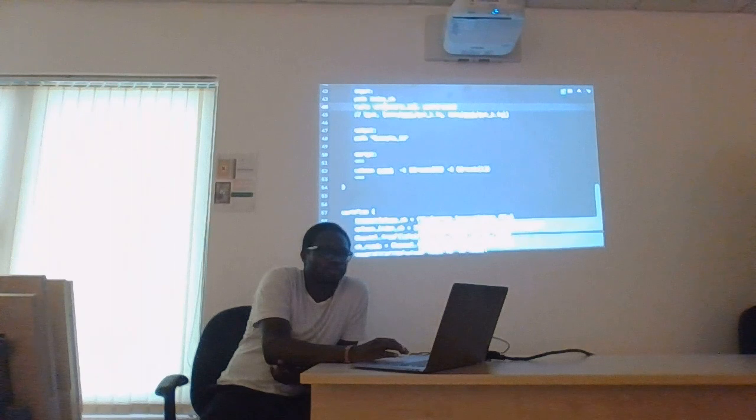Okay. So under the path, you add another thing, which is tuple. Is the tuple a function which is inside Nextflow? Yes. Okay, so you add the tuple and the value is the name of that tuple, or the key of that tuple. So I was trying to understand where you give the sample ID, the name sample ID.